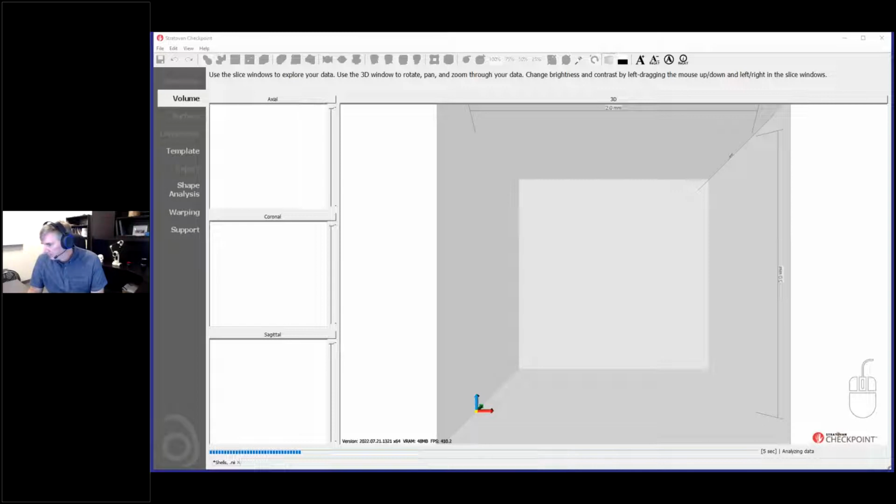Hey, so Candace Small is asking a question. They say they've never worked with micro CT, they've just kind of gotten started, and they're asking, do the scans need to be reconstructed before use in the program, or is what you're working on raw data? Yeah, so they do need to go through the reconstruction process beforehand. The micro CT puts your specimen in the device and collects the projections. That's the raw projection or sinogram data that you get out of the scan, and then it needs to go through a reconstruction process.